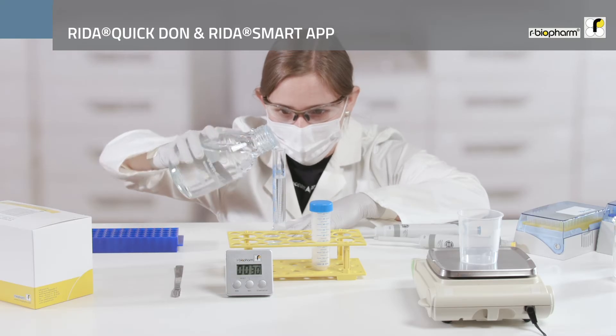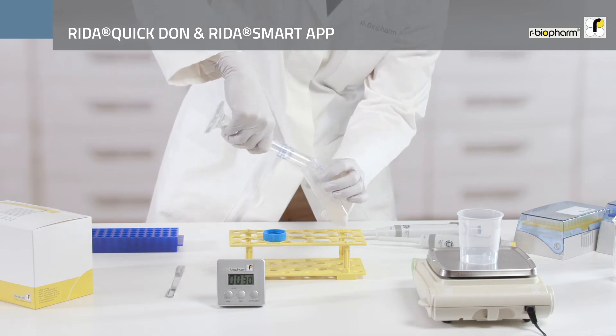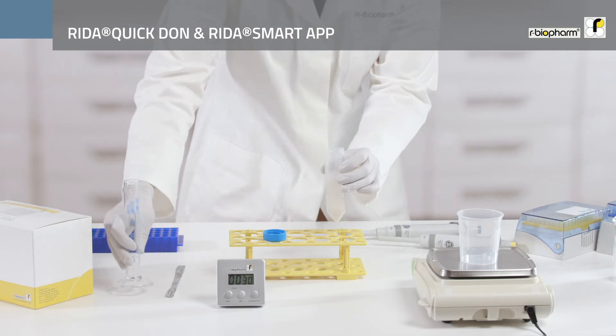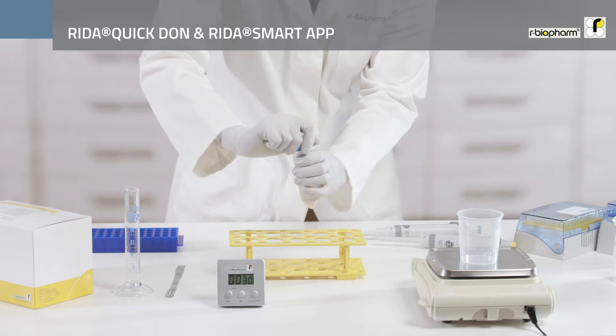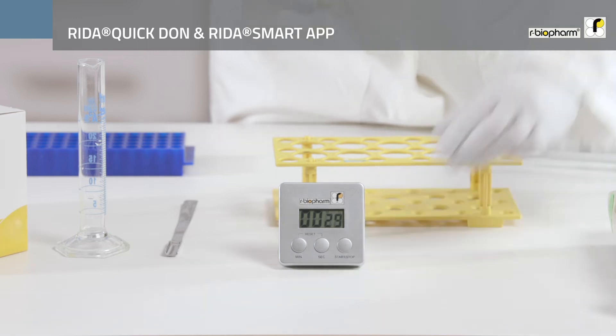The weighed sample is then dissolved in 25 ml of distilled or deionized water and shaken vigorously for 30 seconds. If the sample size is larger, the amount of water must be increased proportionally.